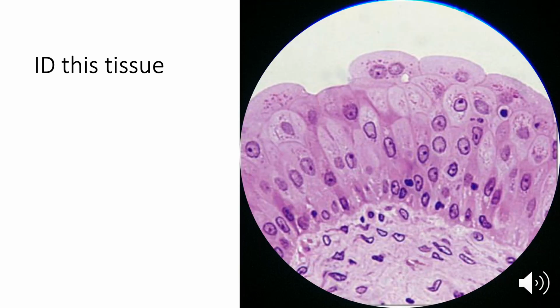And we have arrived at the last tissue. So, one more time, do we have an apical surface? Yes, we do. There's the empty space at the top with our apical surface of cells. So we know it's an epithelium. Do we have multiple layers of cells? Yes, we do. Multiple layers of nuclei aligned. So it's got to be a stratified.